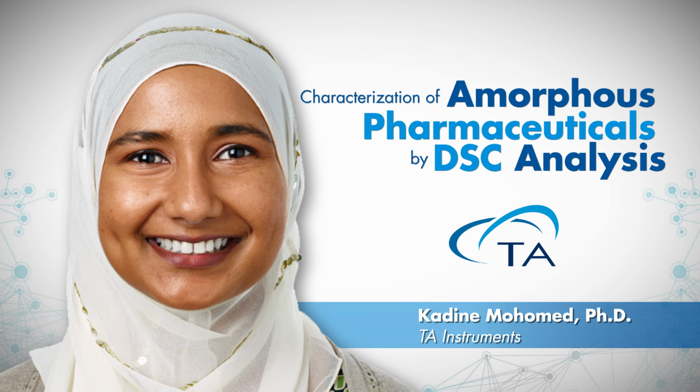Next question. If there is an overlap between melting and Tg, is it possible to use modulated DSC to separate the events? It is possible, but it comes with you needing to try out several different modulated conditions.